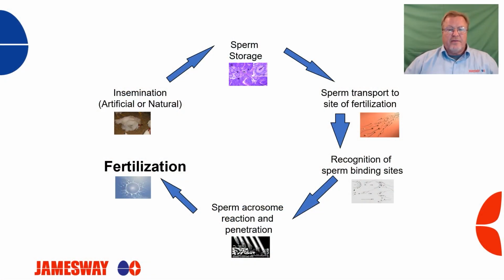Okay, so now that we have candled the eggs, we've determined the eggs that are unviable. We don't know if they're infertile or not at this point. They're just unviable, meaning we don't see a growing, developing embryo in that egg. So then we take the eggs out, and they need to be broken open to be further examined a little bit more closely. We showed you how to do that. So now let's go through a few other things that have to do with determining fertility and infertility in our broken out eggs.